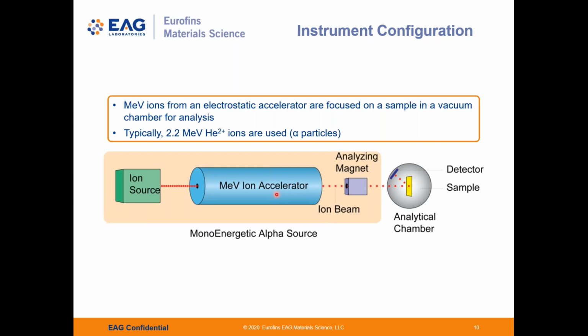Now, this is a summary of the process of beam generation. Beginning with garden variety helium gas. Helium is electronically excited into a plasma. The helium plasma is passed over a charge exchange that consists of an oven that generates an alkali metal vapor, rubidium or lithium usually.